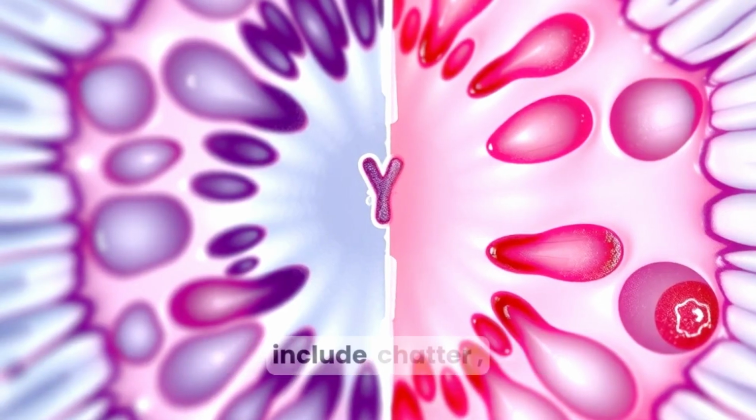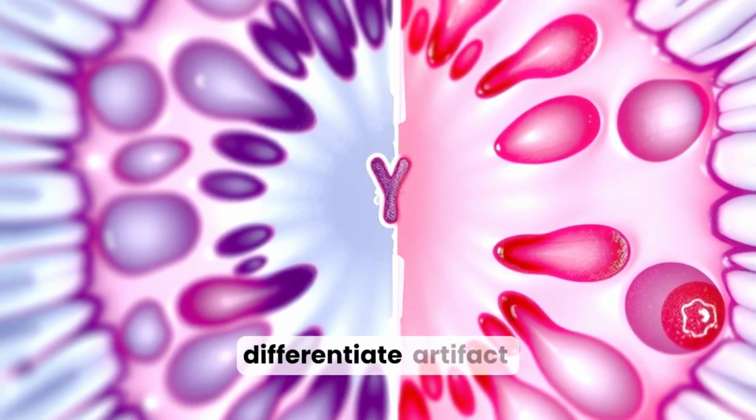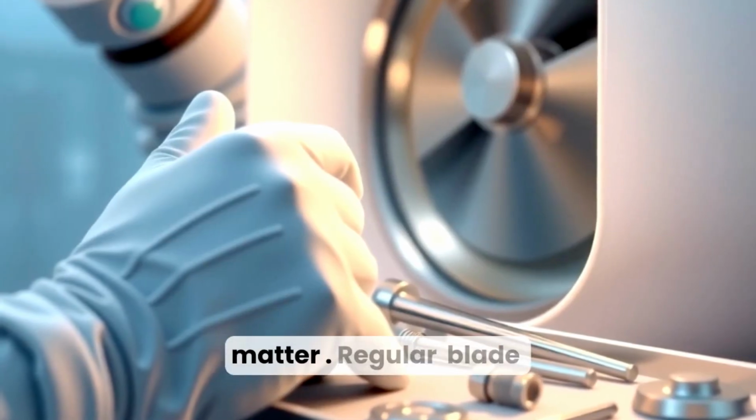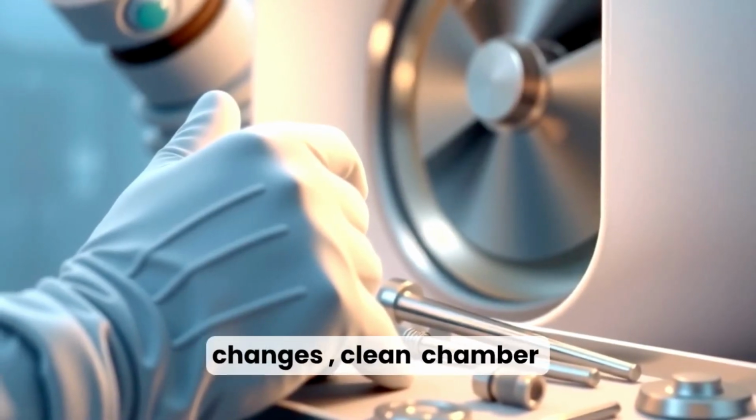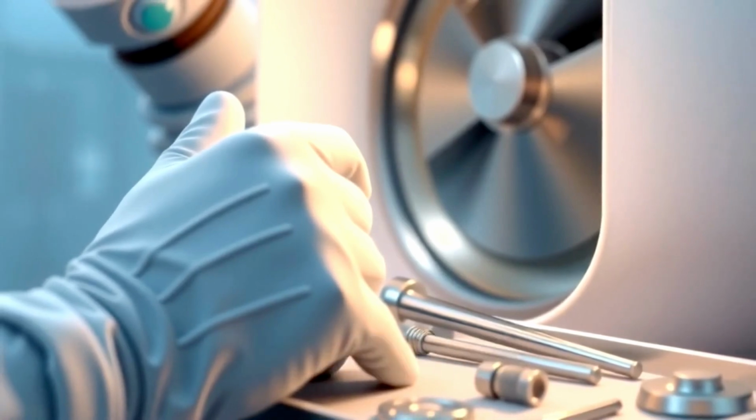Common technical issues include chatter, compression, and thawing. Recognize these to differentiate artifact from pathology. Safety and maintenance matter. Regular blade changes, clean chamber practice, and correct PPE reduce errors and accidents.